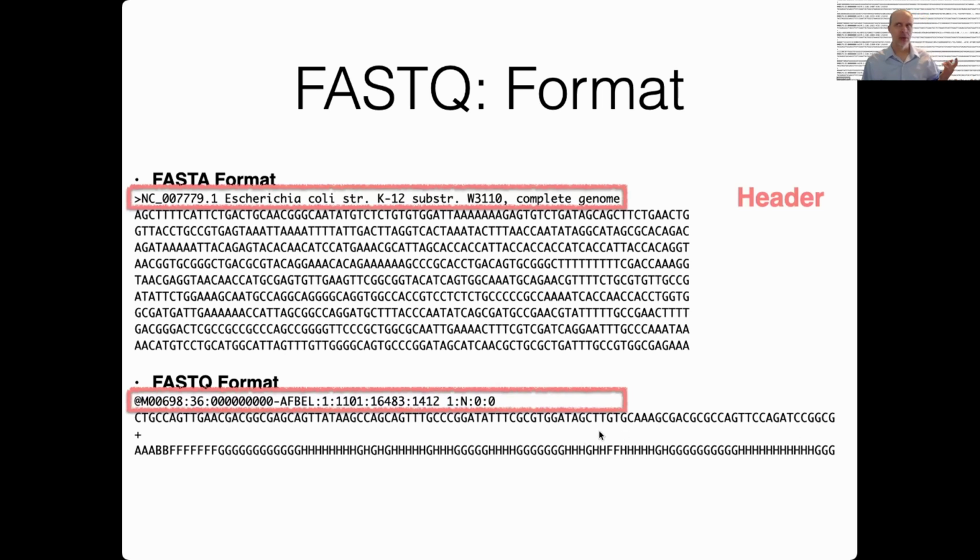So if you were here last week when I talked about high throughput sequencing, I talked about how the different spots on the flow cell are each going to generate a different sequence read, and that when the image is processed, the software keeps track of where on the flow cell a given base came from, so that you can string the sequence together.